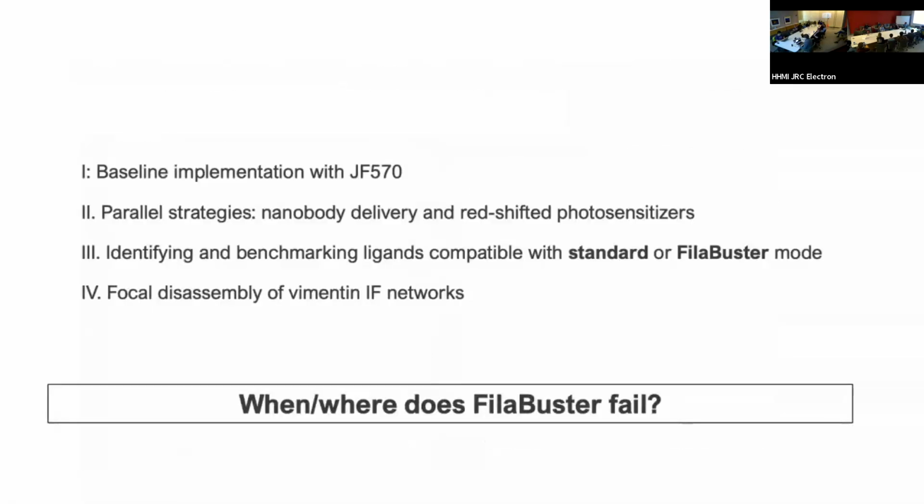So far we've seen the baseline implementation with the photosensitizer works. We've developed parallel strategies using alternative delivery with nanobody and alternative photosensitizer dyes.